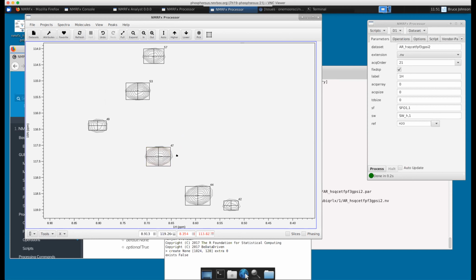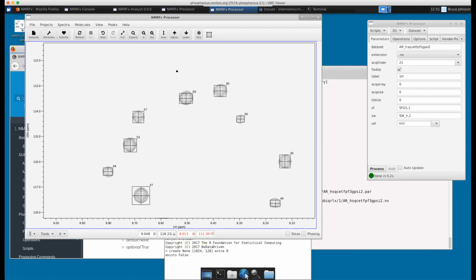If we were not on the box, if we held down the selected peak and held down the Alt key, we could resize it. It turns out that something in the virtual window is capturing my Alt button, so I've made it on the box. You hold down a Control key and then you can resize. And if you don't have the Control key down, you can move the peak around. You can select multiple peaks if you hold down the Shift key as you drag. Now it's a little different color, orange, let go. Now we've shifted all those peaks and we can move multiple peaks.